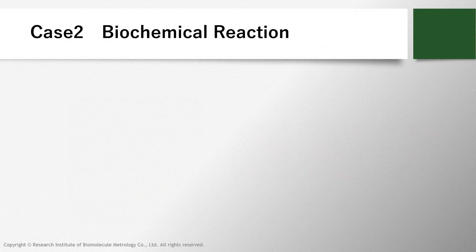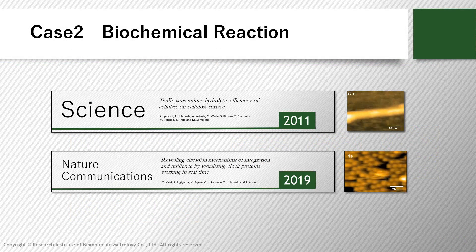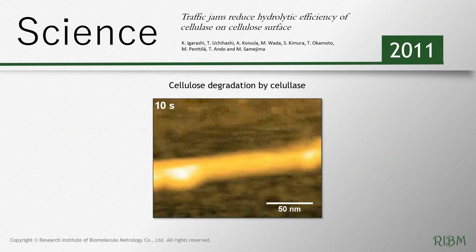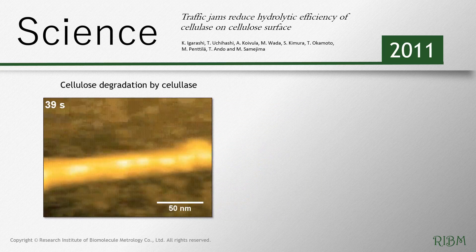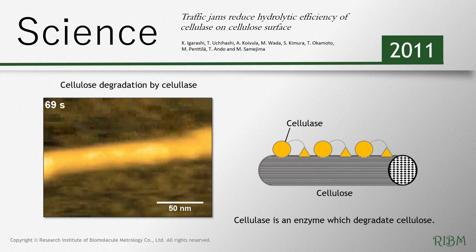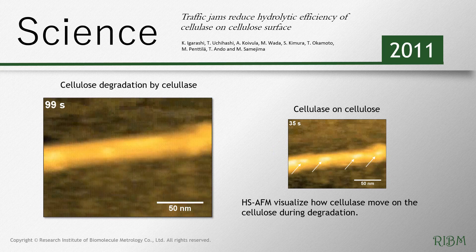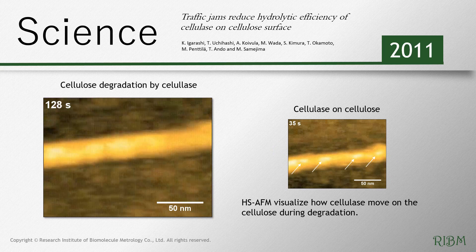Now we are going to introduce two videos in the biochemical reactions section. The video shows the cellulose degradation by cellulase. Cellulase is an enzyme which degrades cellulose. High-speed AFM visualizes how cellulase moves on the cellulose during degradation.